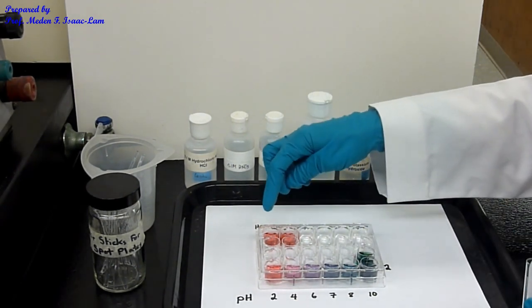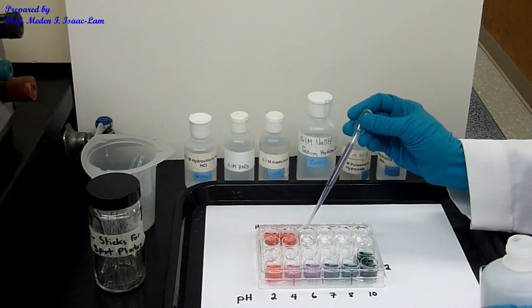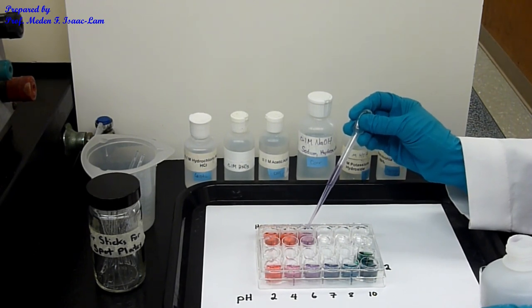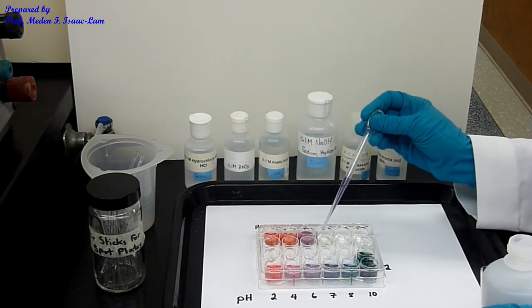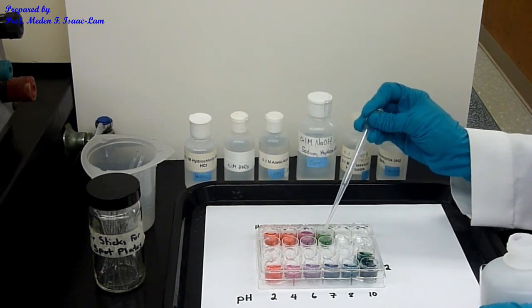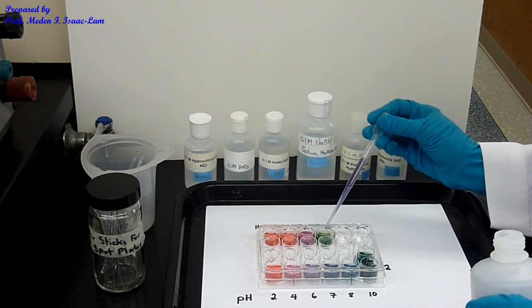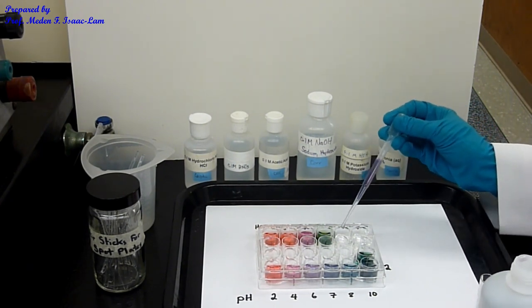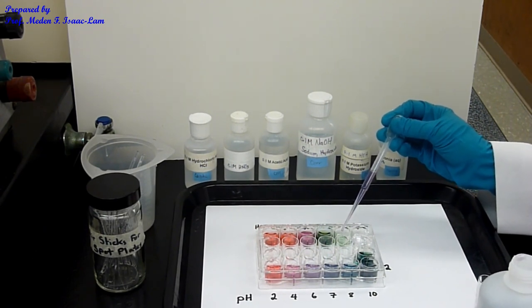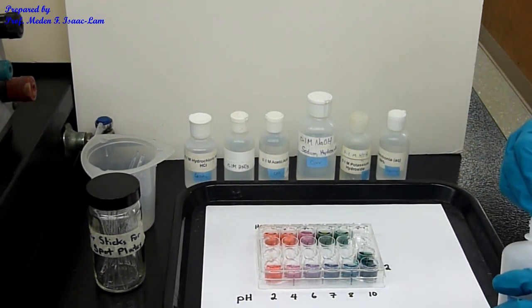So note the color. The first one is hydrochloric acid, next one is nitric acid, and then I'm now doing acetic acid. So that was sodium hydroxide, this one is potassium hydroxide. Last one, ammonium hydroxide.